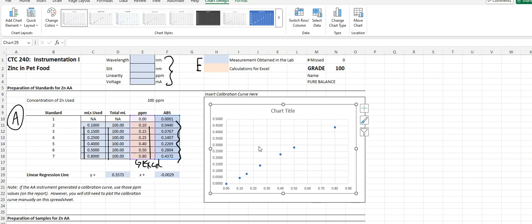So it looks like this is pretty linear, right? I mean, at face value, my eyeballs are like, all of those kind of line up pretty well. That's great. That's what they should be doing. And even on Excel, it should be close to linear. Now, keep in mind, the AA instrument uses new rational, so it accounts for slight curvatures in a way. But on Excel side, when we manually do these, we use Excel.